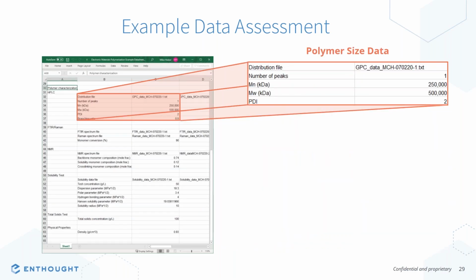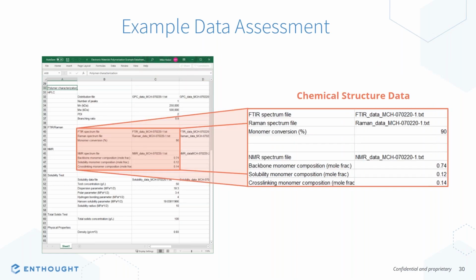And then maybe they go on and characterize the products that they're synthesizing. They're looking at, for example, the molecular weight of their polymers, the distribution, and some of the key features that come out of a molecular weight characterization. And then going on to also look at the chemical structure, using IR spectroscopy or NMR spectroscopy to identify the chemical signatures that indicate to them, did I make the type of polymer that I set out to make at the beginning? So this kind of data, these experiments, are already being run in your lab. How do we figure out and pull out what's important and make sure those things get put into the database?